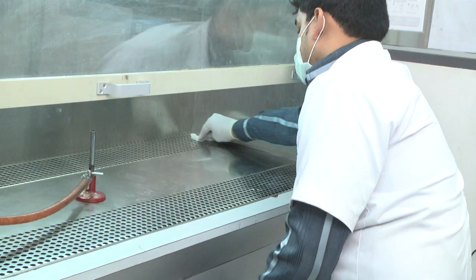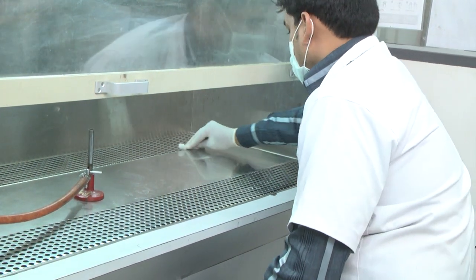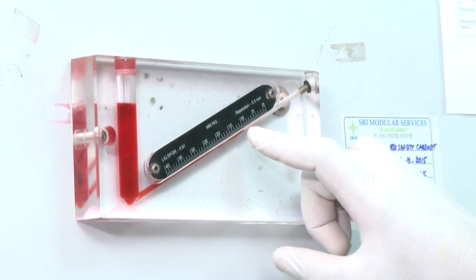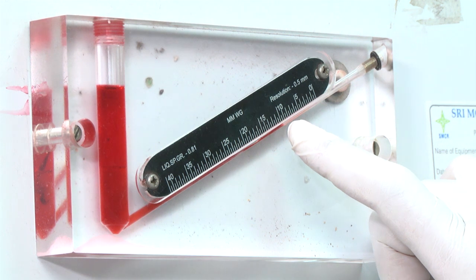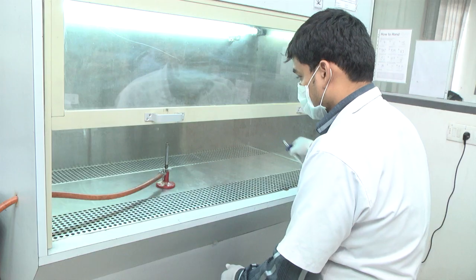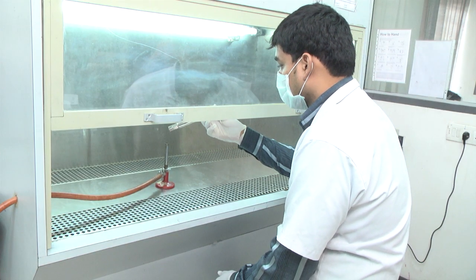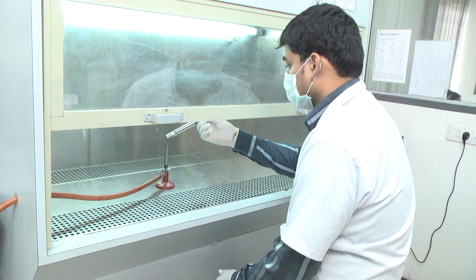Daily Maintenance: Decontaminate the work surface and the interior surfaces of the cabinet with 70% ethanol. Verify the precision of the manometer's reading, indicating any fallen pressure flowing through the HEPA filter. Register the date and the reading in the cabinet's logbook.